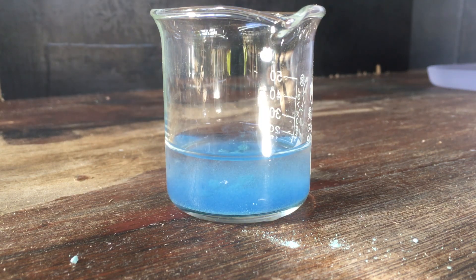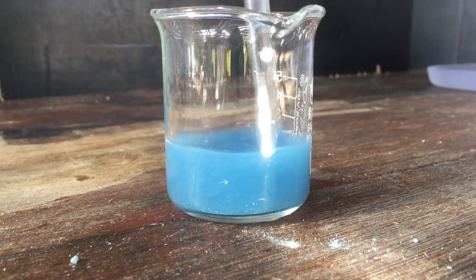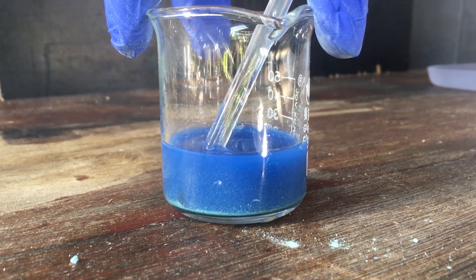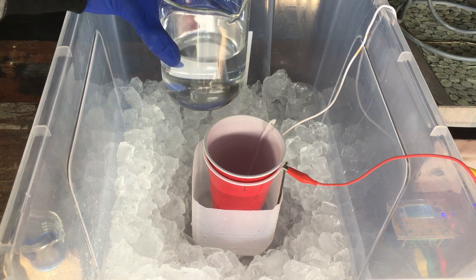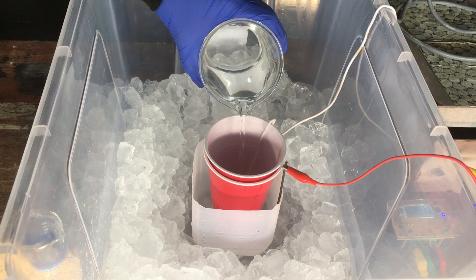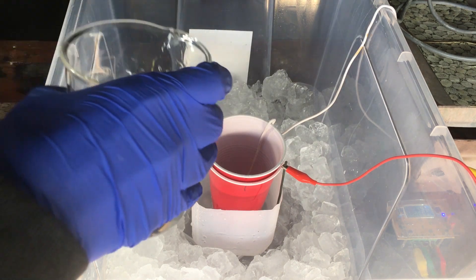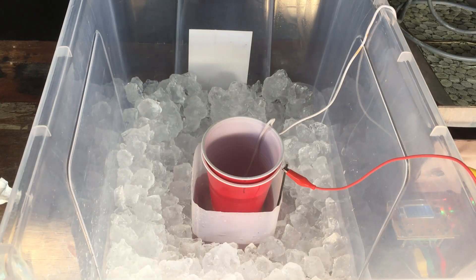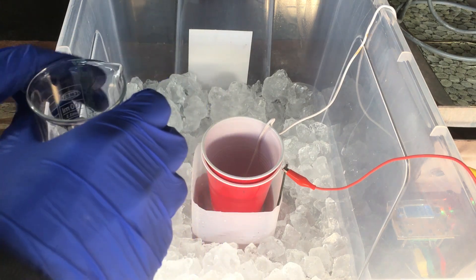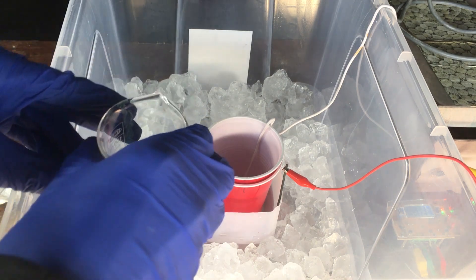You can see instantly we get some reaction, and then with stirring, everything should dissolve. So the last thing is we fill our cell with the potassium hydroxide solution — both chambers, both the anode and cathode chambers, will be filled with this solution. And now with potassium hydroxide added to both chambers, I will add our ammonia plus tetraamine copper to the anode compartment.